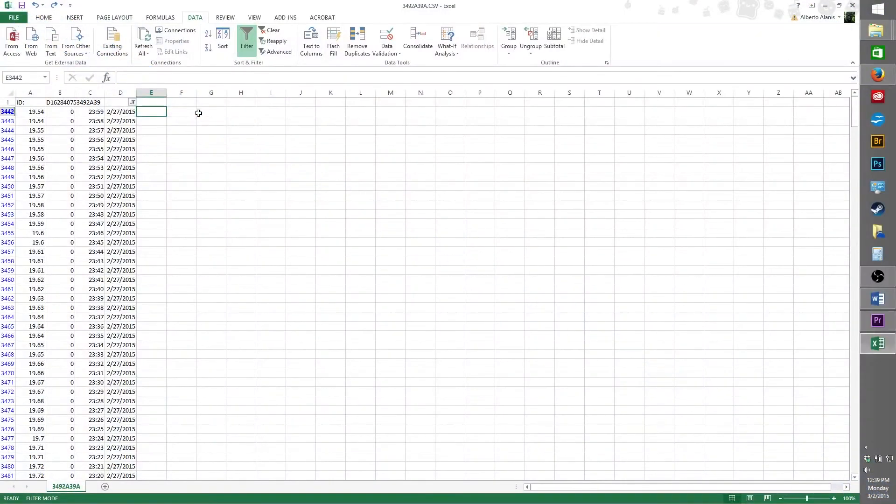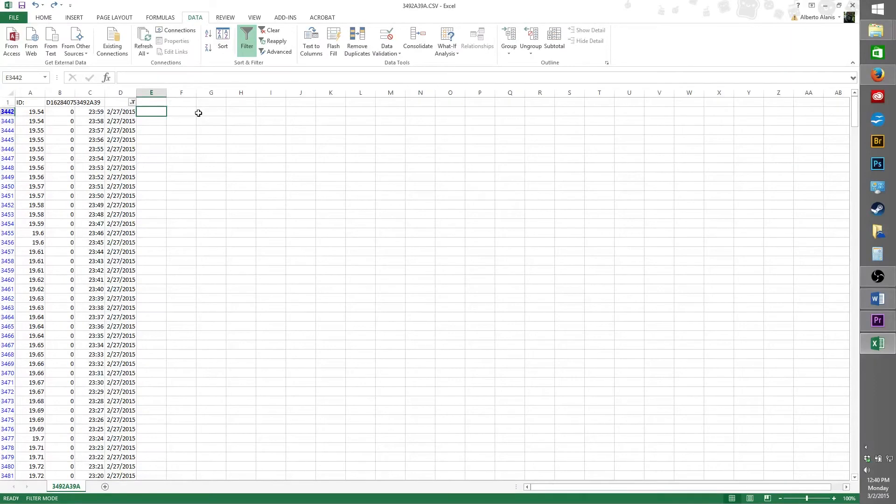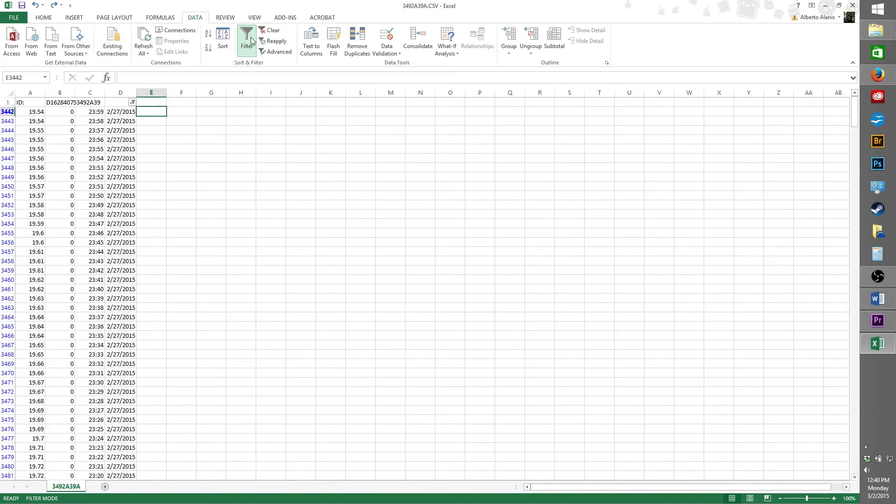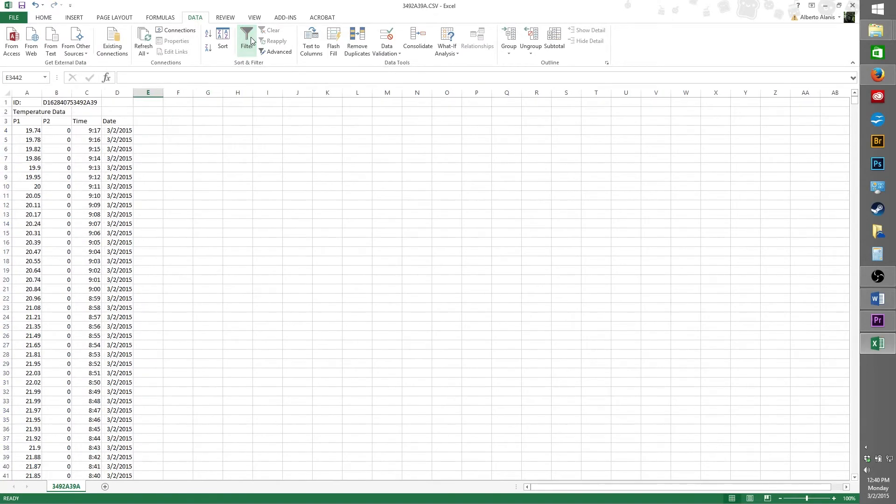For our next and final filter, I'm going to demonstrate how to filter our results to only view the temperature recordings that occurred on February 27, 2015, but this time only between 12 PM and 1 PM. Let's get started. First, we're going to make sure all filters are removed from the spreadsheet. To do this, go to the filter button and click it.